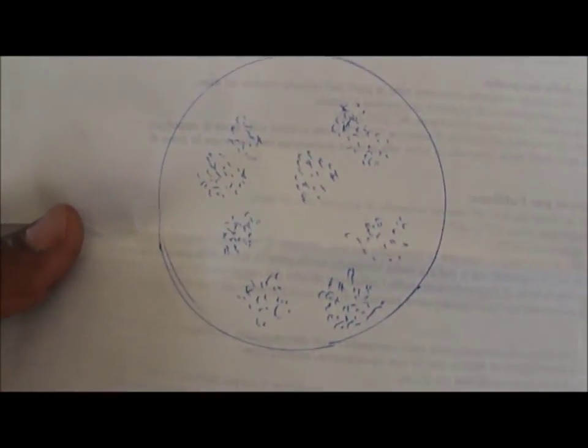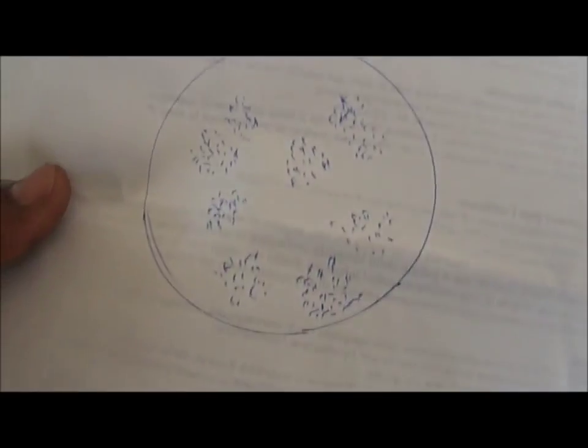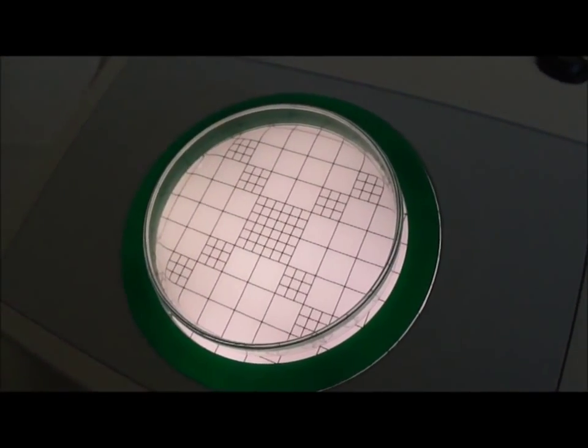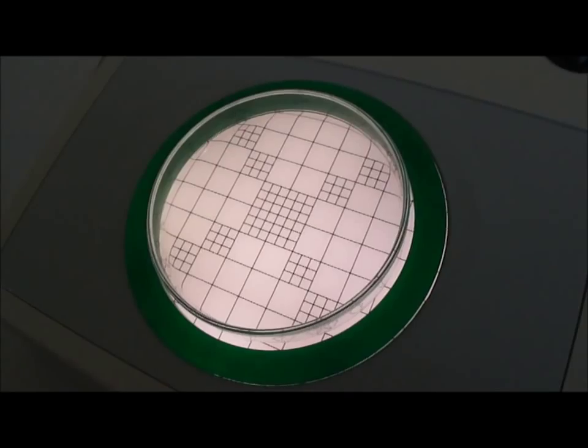You have a certain number of colonies here, and sometimes they are much more densified than this, and then it's difficult to count. And then you put this on the top, and since the petri dish is transparent, you can see the colonies inside, and you have these squares inside that will make your counting easier.